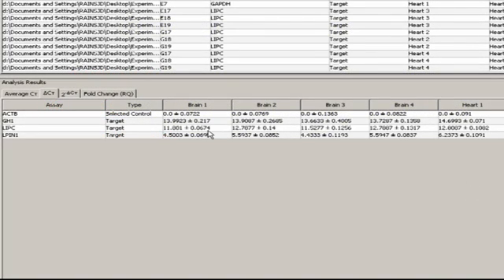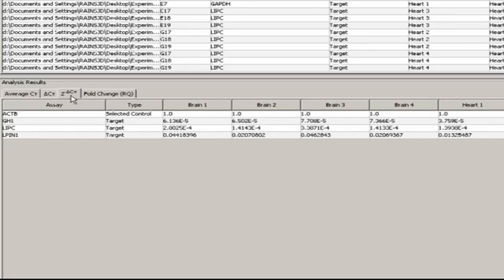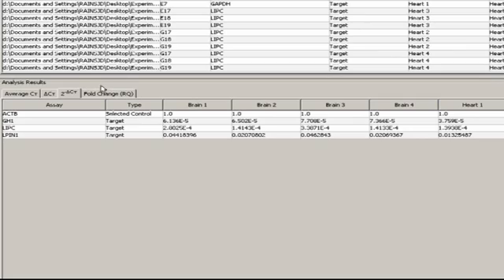The next column over converts these logarithmic average delta-CT values to linear values by applying the formula 2 to the negative delta-CT. For people who have done delta-delta-CT calculations before, you'll note that this log-to-linear conversion generally happens last, after a second subtraction, to get delta-delta-CT values.